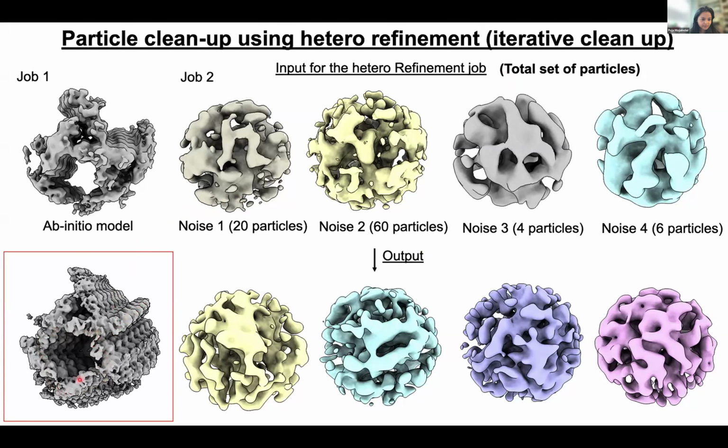Now this is my total map, the total volume, and for the model building, I use this cross section which is colored in purple here. Using that, here I show the protein parts of the filament where I can see the side chain densities very nicely. And this is the density for the cyclic RNA signal molecule, cyclic tetra-adenylate, and the density was good for all the parts.